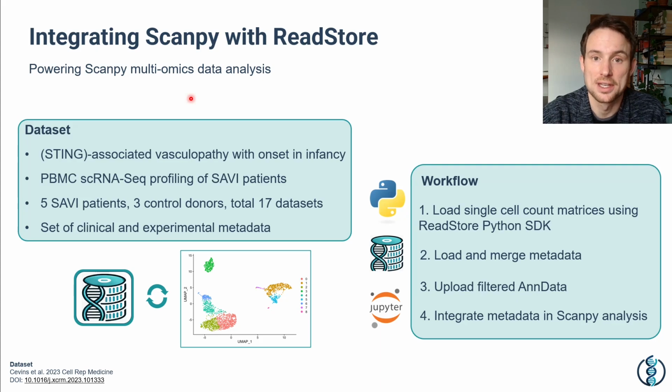Scanpy is a fantastic tool for single-cell RNA-Seq analysis in Python that is widely used in the community. And we want to see how we can even boost our analysis workflows using a combination of ReadStore and Scanpy to facilitate import of datasets and annotation of metadata.